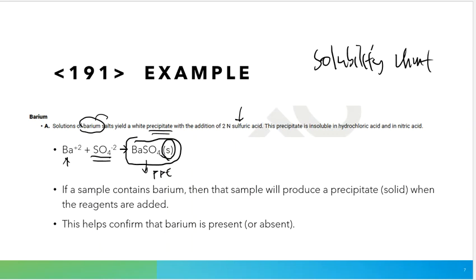If this fails, then there's no sense in testing this for anything else, because the major player, which maybe is barium in this case, is not present. And if that's not present, we don't have the stuff that we think we have, so we just completely stop all the tests from that point on, and we go on to something else.